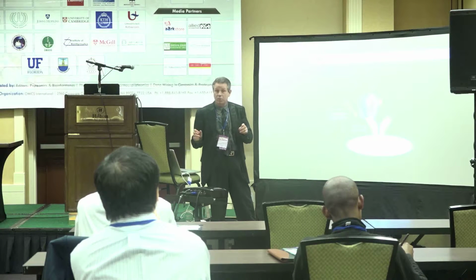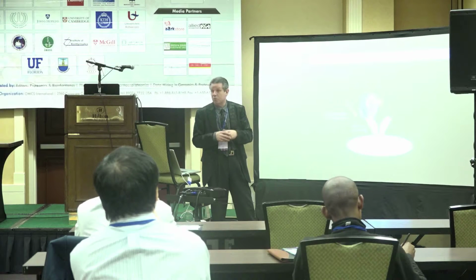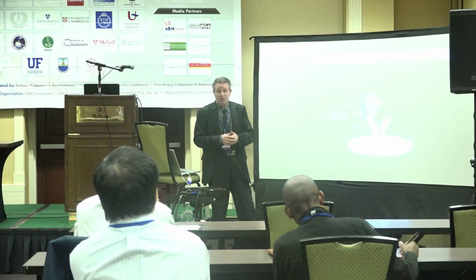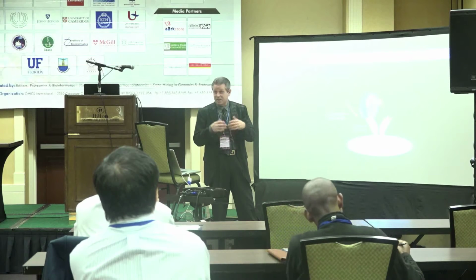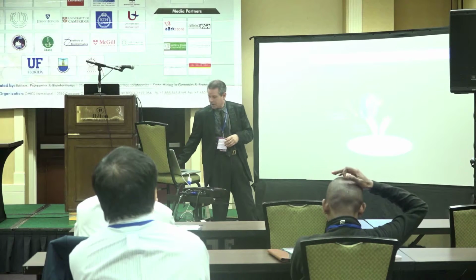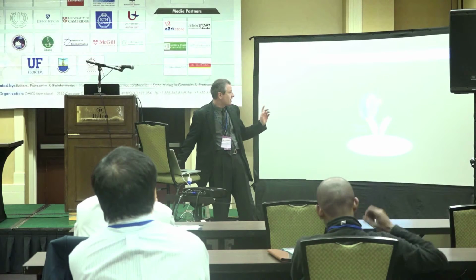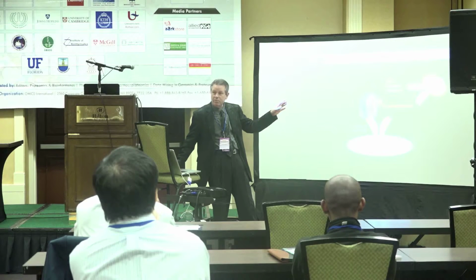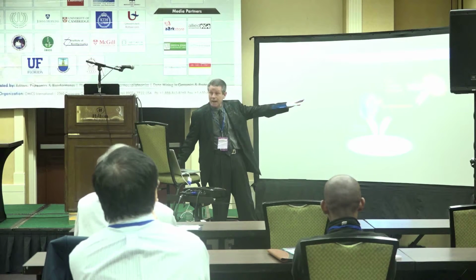By the way, we typically use about 50 micrograms of protein to do an analysis from crude cell lysate. We can take tissue, we can take extracts from cells, we can take serum, we can take urine. We've gotten samples of all of them that work on the microarray, so it's extremely sensitive. So we capture the protein, and now, let's say this is a tyrosine phosphorylation site, we incubate it with a reporter antibody that we've dye-labeled.